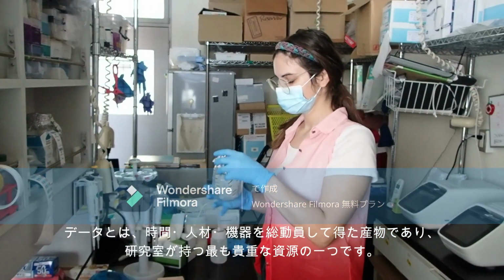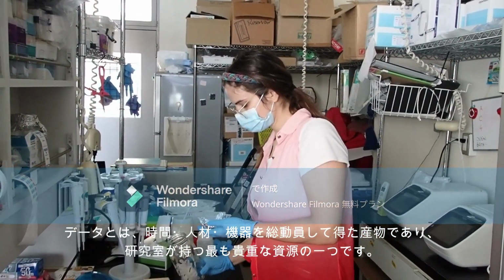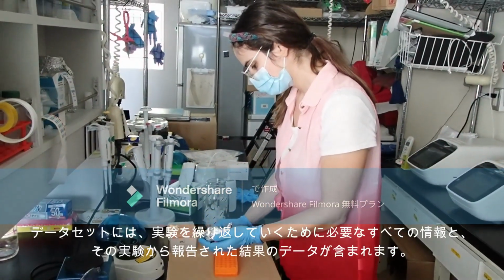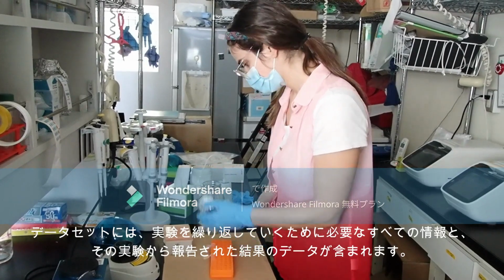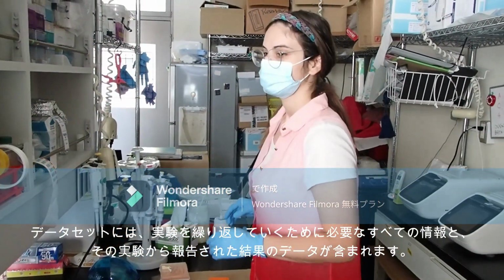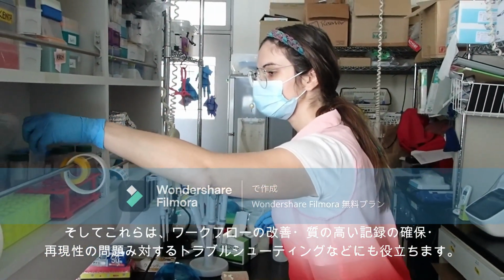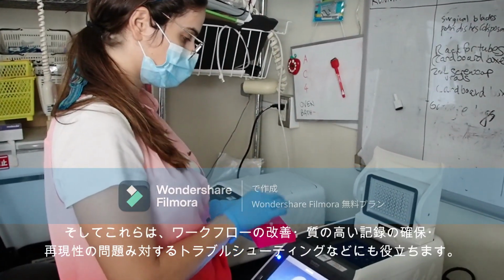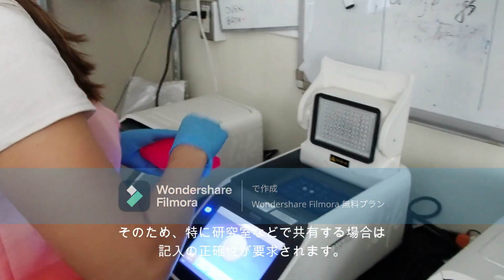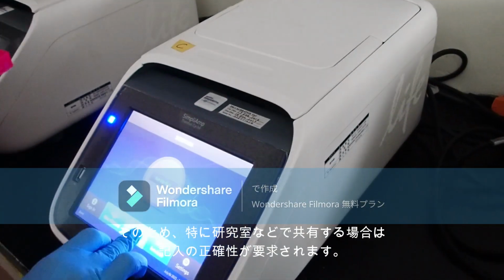Data is the result of parallel investment of time, people, and equipment, and one of the most valuable resources your lab has. A dataset includes all the information required to repeat the experiment and the resulting data reported from that experiment. It improves workflows, ensures quality records, and helps troubleshoot reproducibility issues. For this reason, it is extremely important to record them correctly, especially when they are shared, for example in a lab.